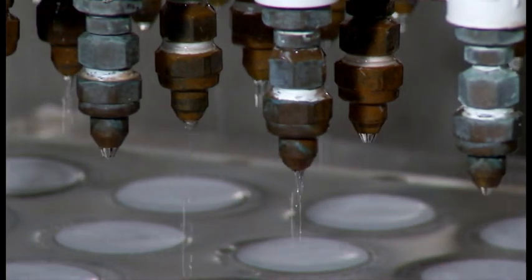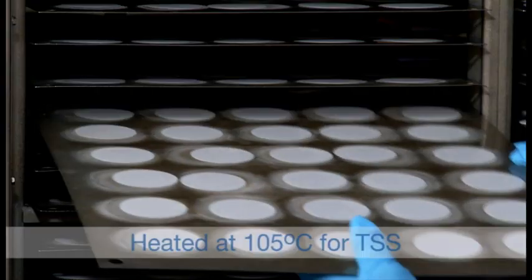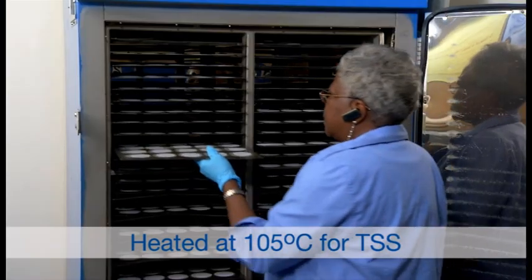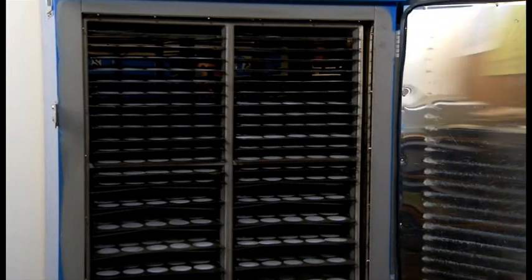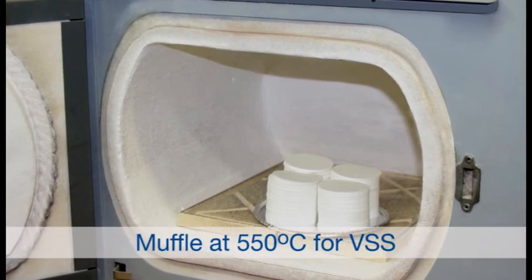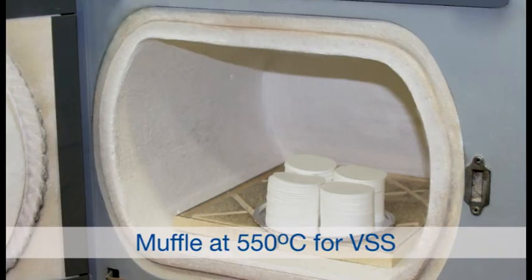The filters are removed from the washing station and placed in a convection oven at 105 degrees Celsius until perfectly dry. For volatile ProWeigh filters, they are transferred to a muffle furnace at 550 degrees Celsius for 15 minutes.